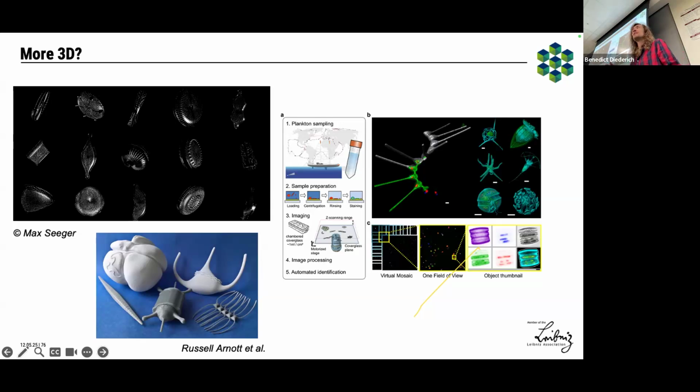I think it's nice if you're at a party and you want to capture as many faces as possible. But if you're only interested in one row of the people here, then it's a bit bad, because you have the information of everybody along the optical axis. It's nothing against you. It's just the information I want to have access to. And so this thing is called optical sectioning.